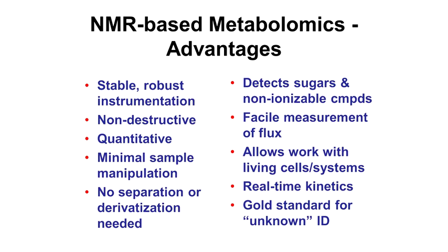NMR is highly quantitative. And we talked about that with the dependence on the number of protons and the fact that you can scale very accurately. There's very little sample preparation. There's no HPLC, UPLC requirements. You can literally drop samples into the NMR tube. I've heard of people even peeing into the NMR, and you can start collecting. So it's a very, very minimal sample preparation. You don't have to derivatize things. You don't have to do any chemistry.